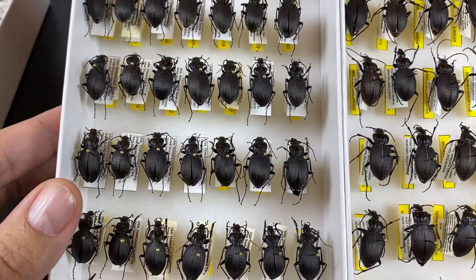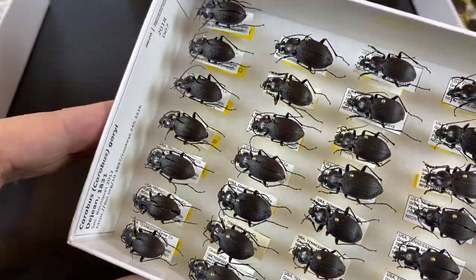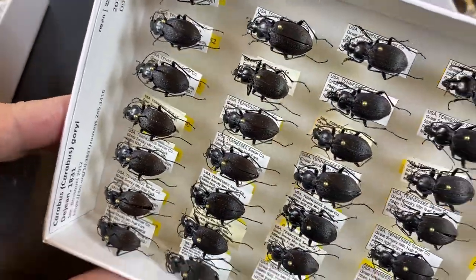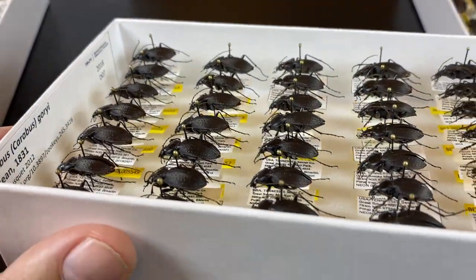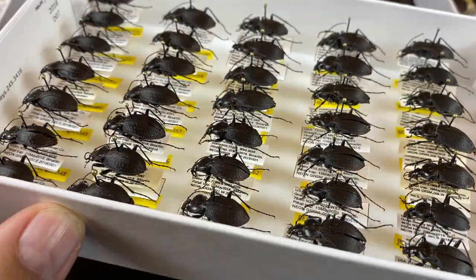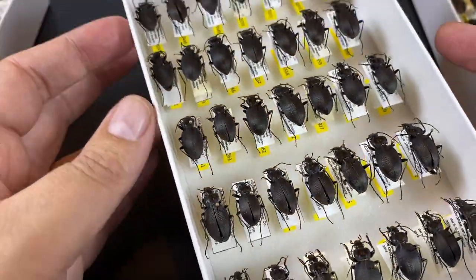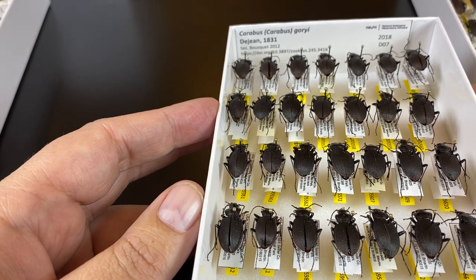These are pinned insects, and they should last — if they are not gotten to by other insect pests, humidity, or fungus — for hundreds of years in a museum. We have examples of this going back at least about 250 years or so. These should be around for decades and centuries to come for future generations of researchers.